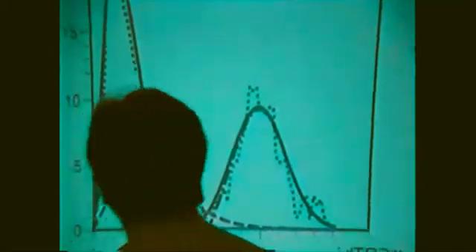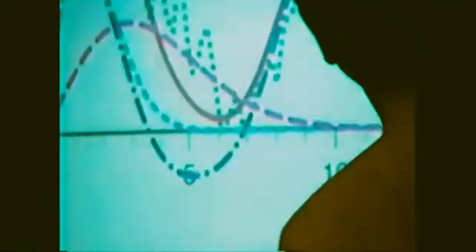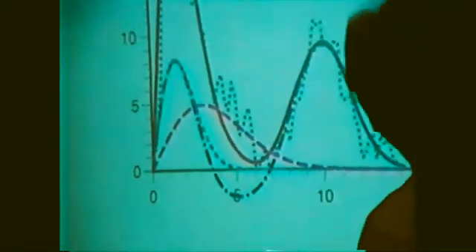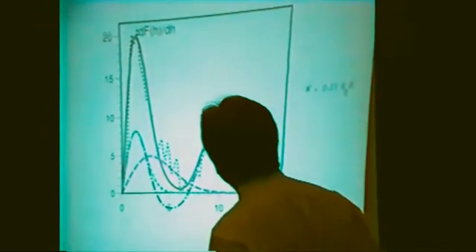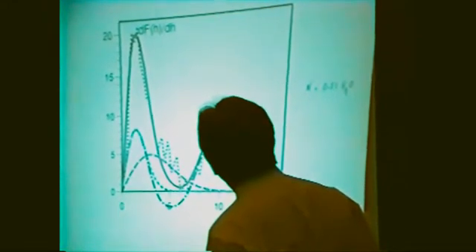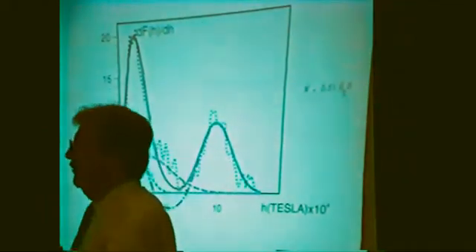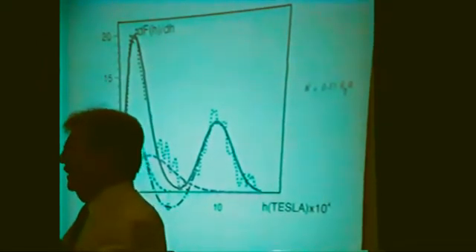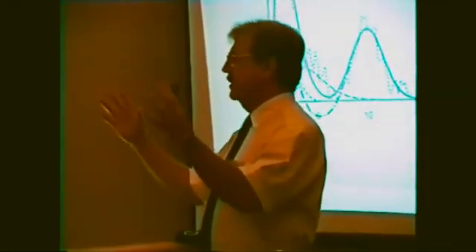And this is why you see that the experimental signal is noisy, but the red is the simulation. And we see that we absorb one water molecule per 2 acidic OH groups, and we form hydroxonium ion in dark blue, and we need 2 lines for the simulation of the OH group. We need 2 lines because, as has been said, you have many OH groups in strong interaction because you have clusters, but you also have some isolated OH groups. And of course, in that case, you have a Gaussian distribution.